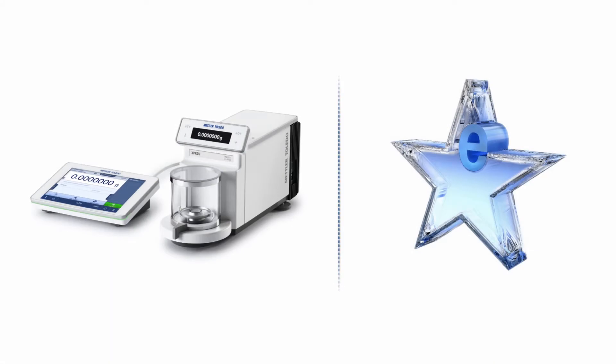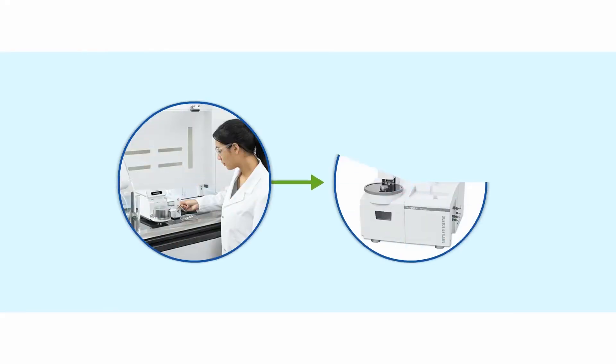The remainder of this video shows you how to transfer weight values from an external balance to STAR-E software. Weigh-in tasks can be performed while another TGA experiment is running for improved efficiency and speed.